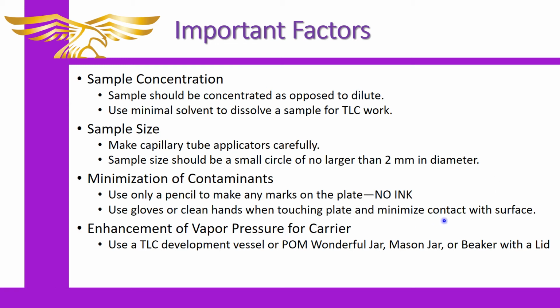What happens when you hold the material is that you're going to introduce any contaminants on your hands onto the plate. The oils from your hands may contaminate the plate. They could become part of the experiment. They could also block passageways in the plate if there was enough of them, and that could cause errant results in your experiment. So you don't want that.